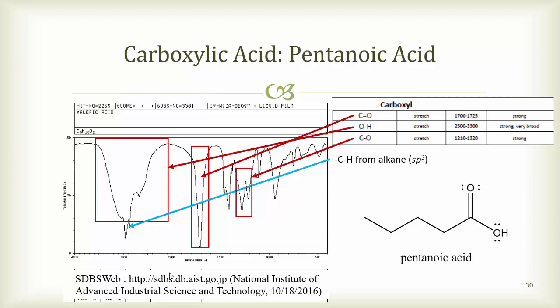Up next is a carboxylic acid. So again, this has that carbon-oxygen double bond, and again it's going to show up around 1700 wave numbers or just above it as a very fat peak. This also has an alcohol, but this alcohol looks extremely different from the alcohol I showed you before because this alcohol is bound to the sp2 hybridized carbon of a carboxylic acid. This unit works together as a whole.